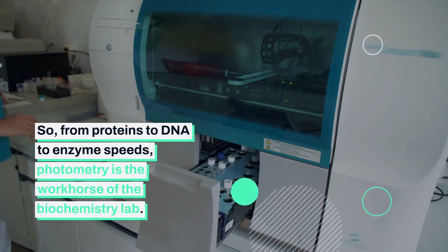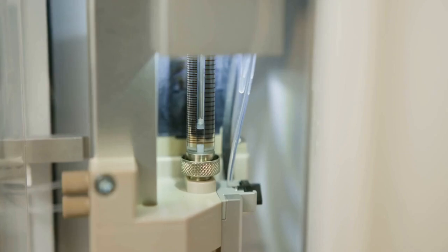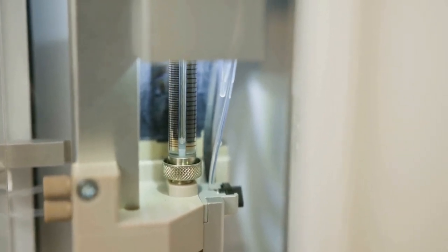So, from proteins to DNA to enzyme speeds, photometry is the workhorse of the biochemistry lab, allowing us to see the unseen by simply measuring light.